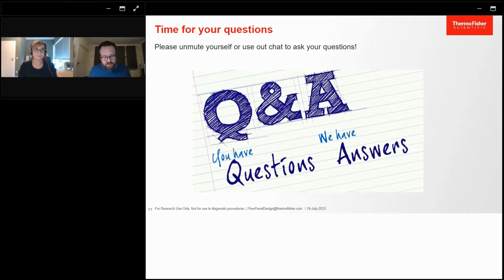Great. Thank you for that answer. Another question that's come through is, when you design a panel, do you make recommendations for which controls should be used?